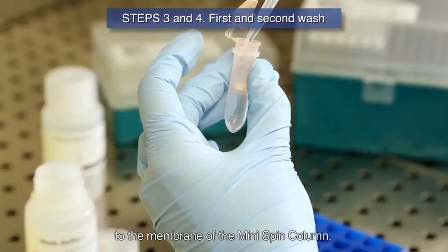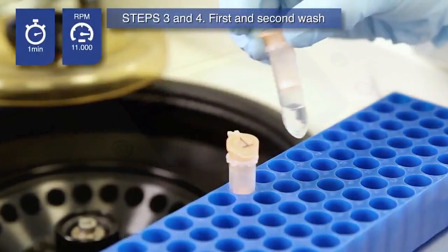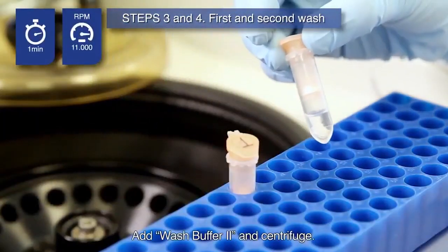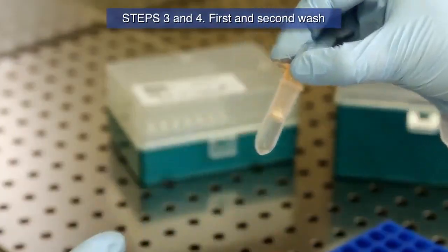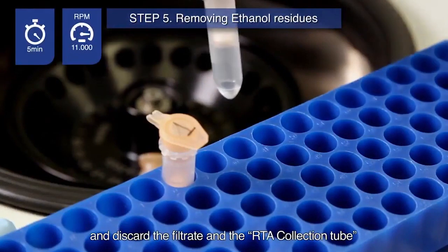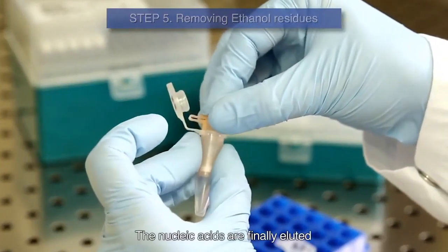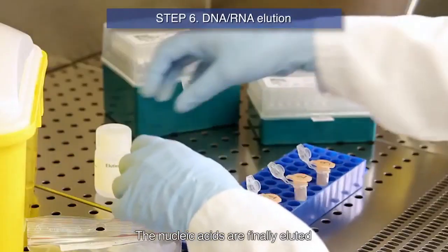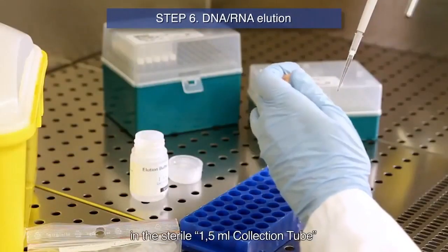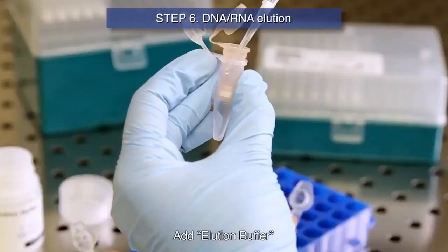Contaminations and enzyme inhibitors are efficiently removed during the following wash steps, while the nucleic acids remain bound to the membrane of the mini-spin column. Add wash buffer 1, centrifuge and discard. Add wash buffer 2 and centrifuge. Repeat this washing step once. Centrifuge to remove ethanol residues and discard the filtrate and the collection tube.